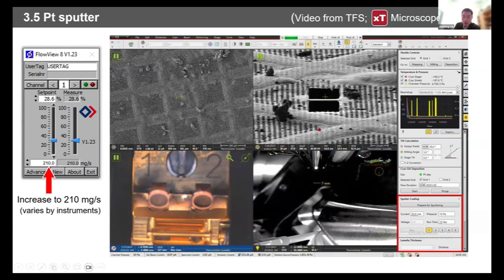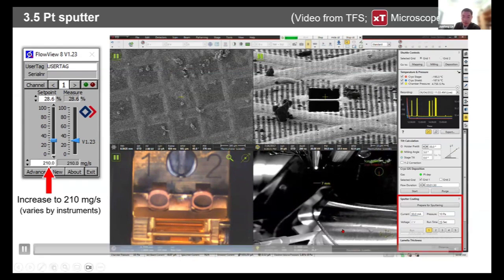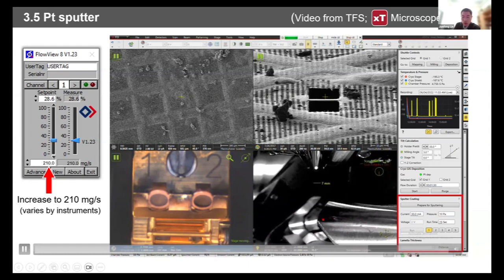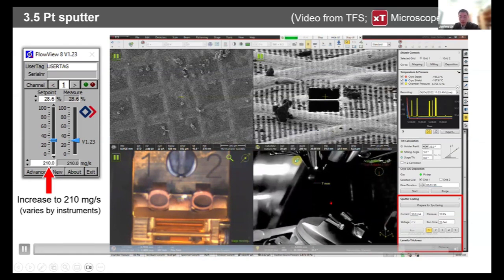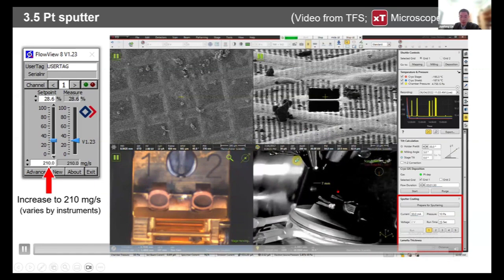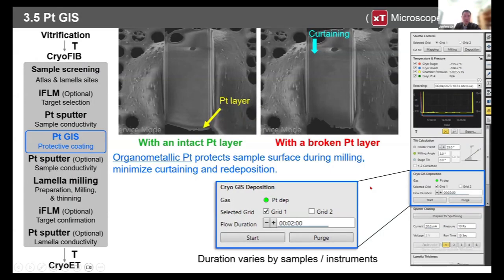So this shutter is retracted, and the sample moves away, and now it's safe for the tube to be retracted. And then the sample will move back to the location for the next experiments. After that, the sample is still not ready yet. Now we will deposit another layer of platinum.